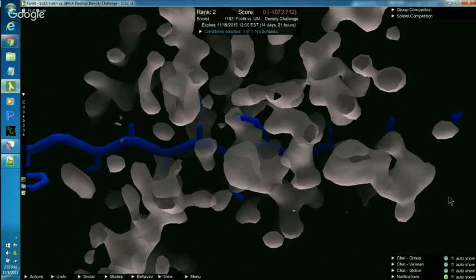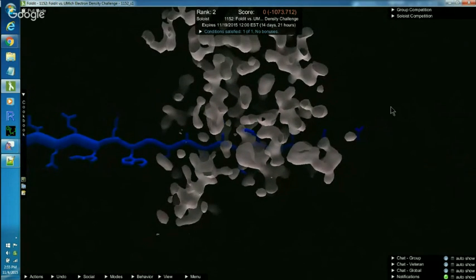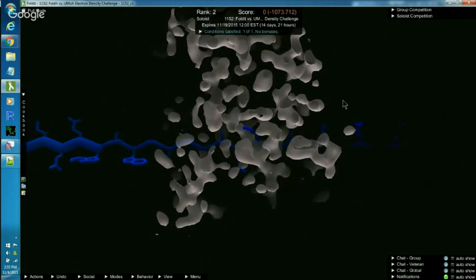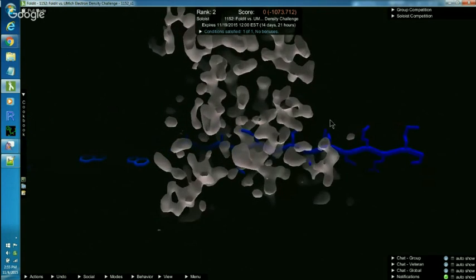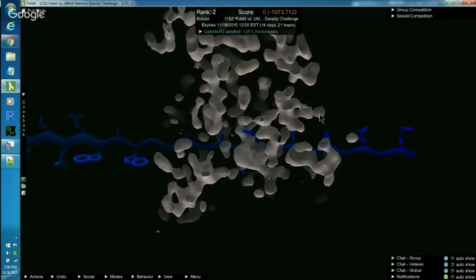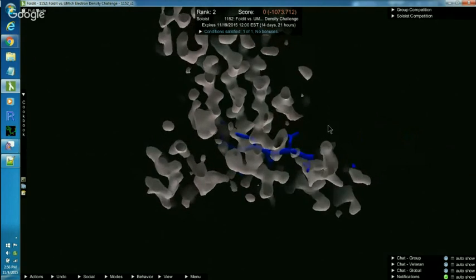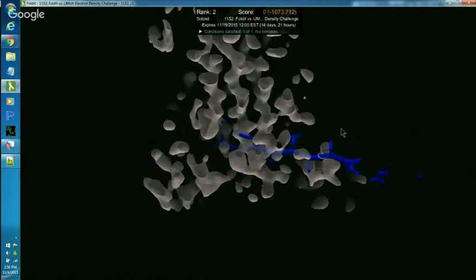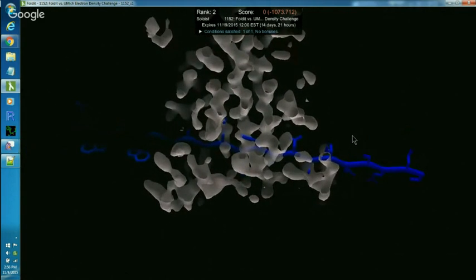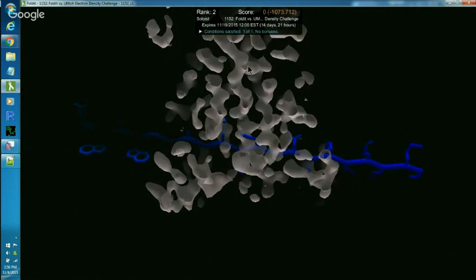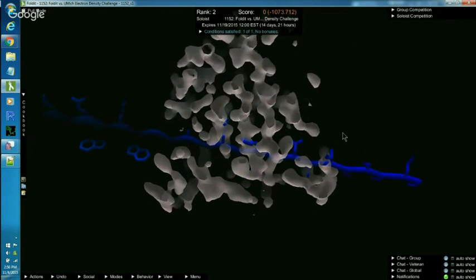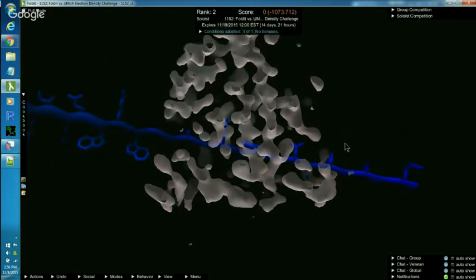And I'm going to zoom out a little bit and see what I can see now. We're just looking at a slice right through the middle of the cloud. And we're able to do that because we put the protein in the middle of the cloud. Immediately, I see some long strands. This one right here and this one right next to it of continuous backbone.